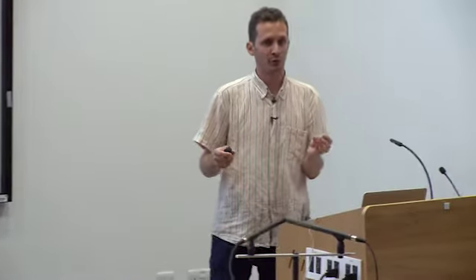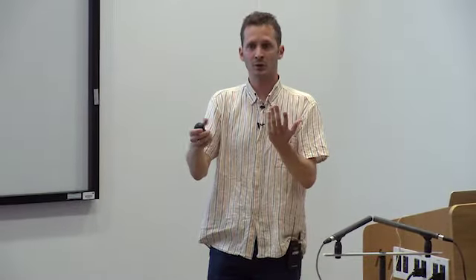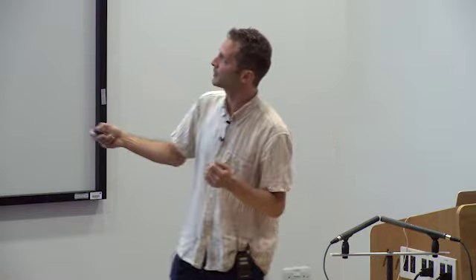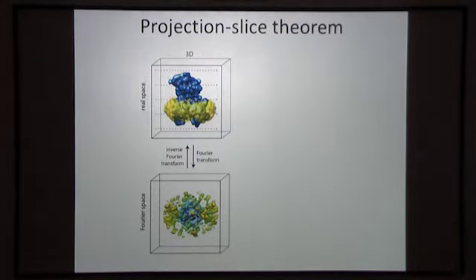But Paula nicely introduced last week this Fourier space and how that's much more convenient to work with in many aspects of cryo-EM. And both Richard and Paula showed this image of the duck, where we have the Fourier slice theorem, and I have my own images of that. This is gamma secretase, and there's this Fourier slice theorem that says there's a 3-dimensional object. I can calculate a 3-dimensional Fourier transform, and Paula explained this very nicely.